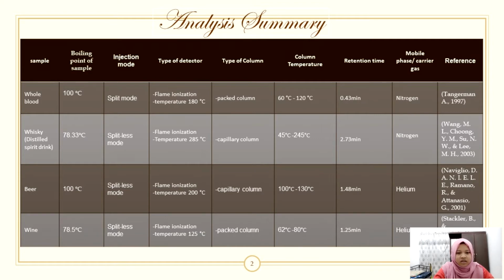The type of detector that you will use in all of the samples is flame ionization, or we call it FID. FID operates by the ionization of sample molecules in the flame, and the compounds detected by the FID are only organic molecules that can be ionized.